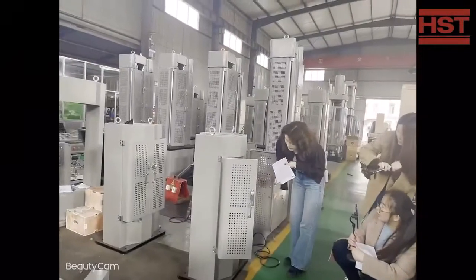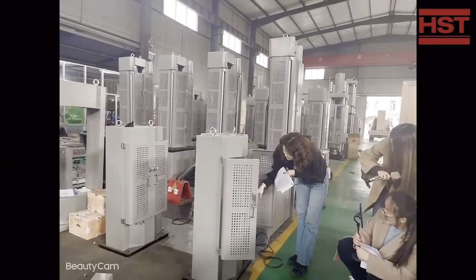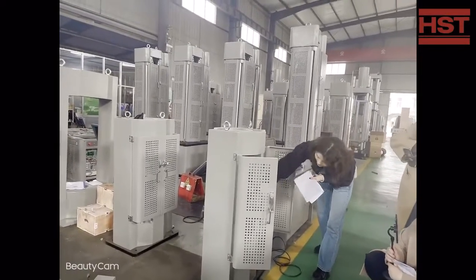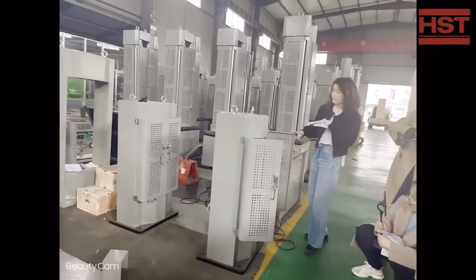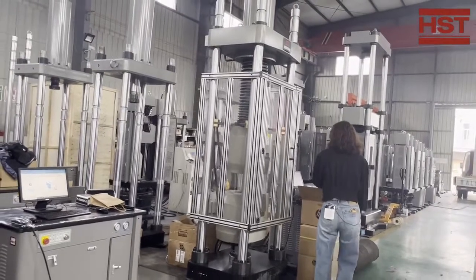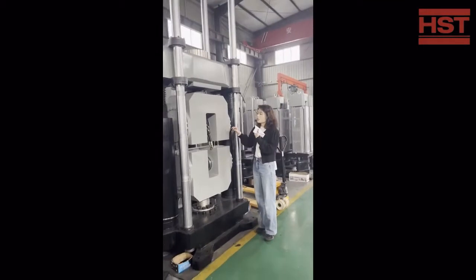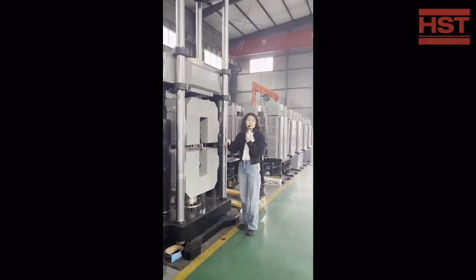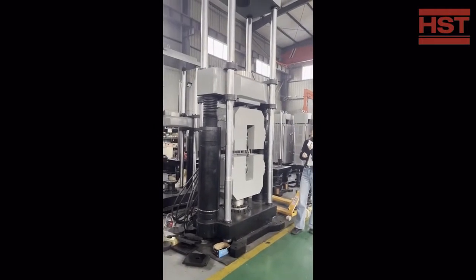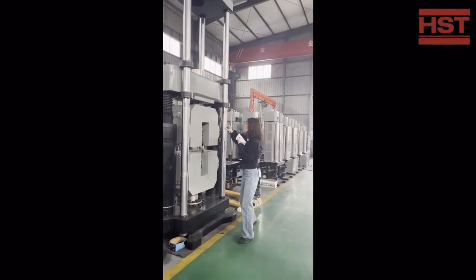You can place the specimen on the compression plate and control via this computer to adjust the distance between the plates. This is the huge grip, and there are different clamps to meet your requirements to do different tests for different applications. You can see these come in two-clamp and four-clamp configurations.